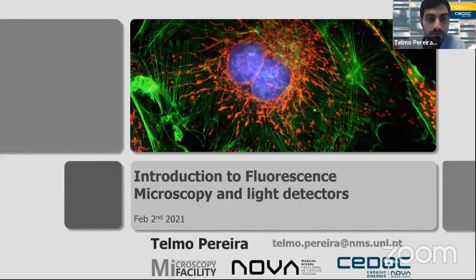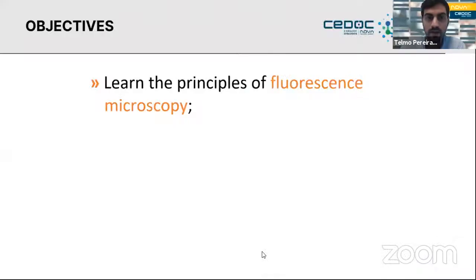Okay. So in the next couple of minutes, I will want to show you the principles of fluorescent microscopy, and so how it works.